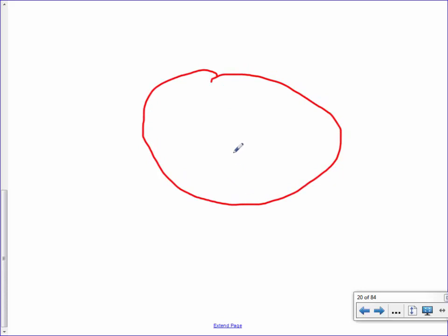Okay. When you look through a microscope, it's probably going to look something like this. You're going to have a big circle, and then most of my microscopes have just a little line, almost like a pointer. And the pointer is just trying to give you an idea of where the middle of the circle might be. So if you have to move the slide just a little bit one way, left or right, you can line your slide up so that whatever object you're looking at is right in the middle of the pointer. Not every one of my microscopes does, but most will look something like this.